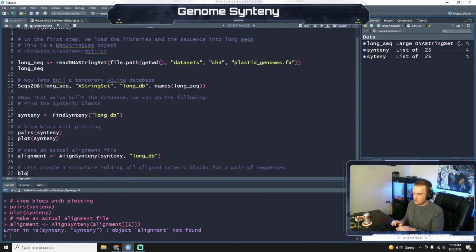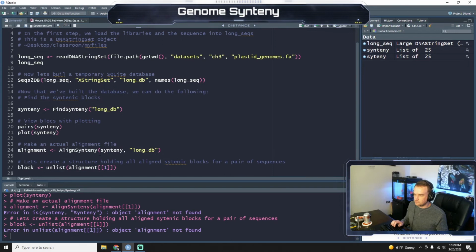So with this package, besides that table, we have to export each comparison by itself. You could write a function to go through and do them all, I suppose. But we will just do the first one.